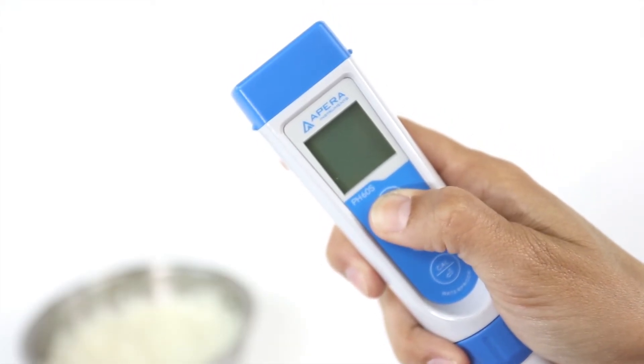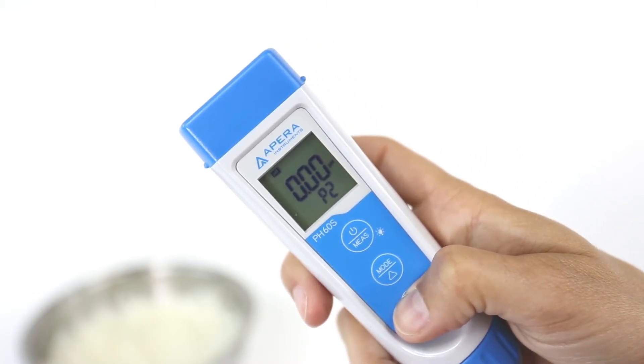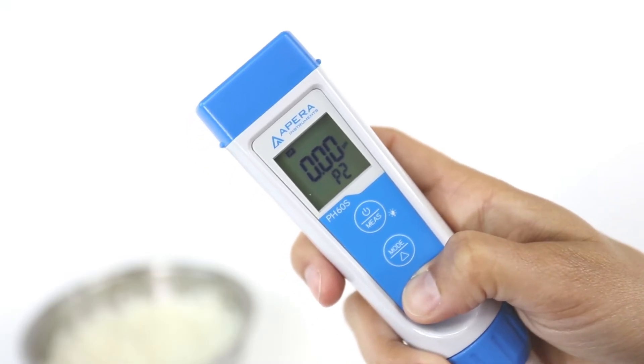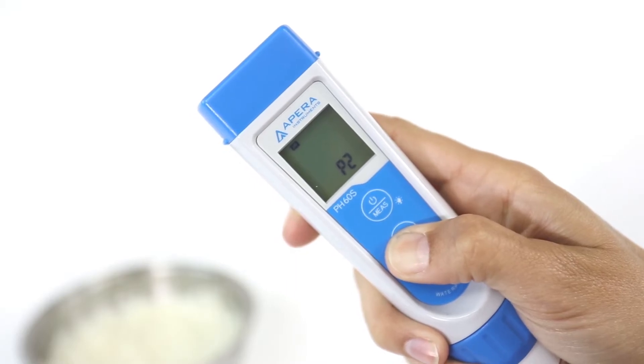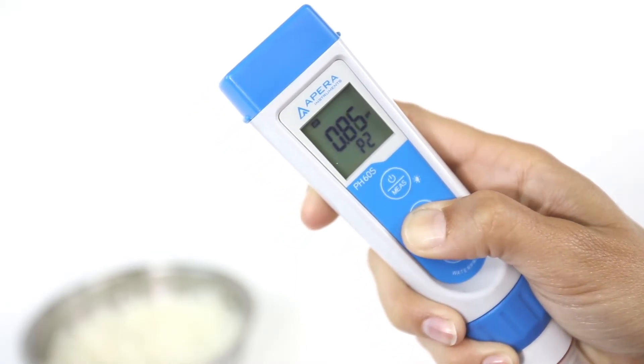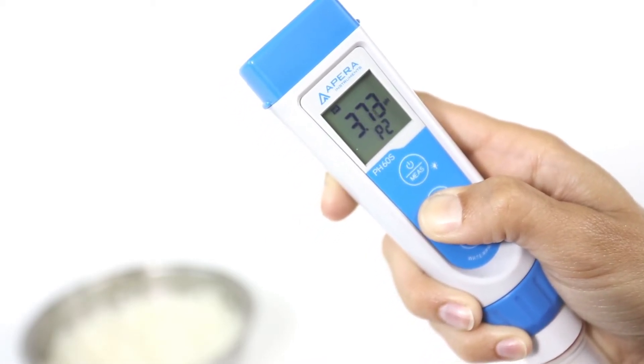When turned off, long press the power button to enter the menu setting. Press the arrow button to go to P2. Short press the enter button and you will see the pH value flashing. The factory default setting is 0.00.